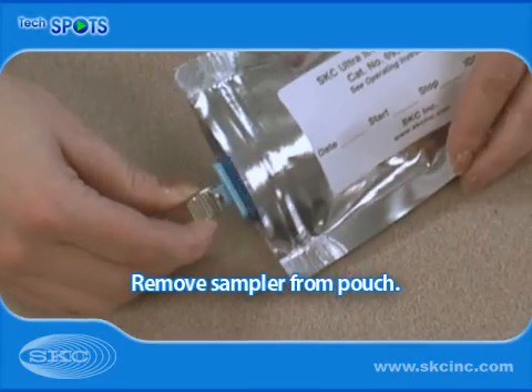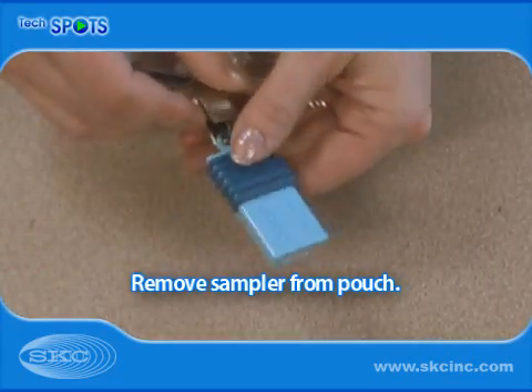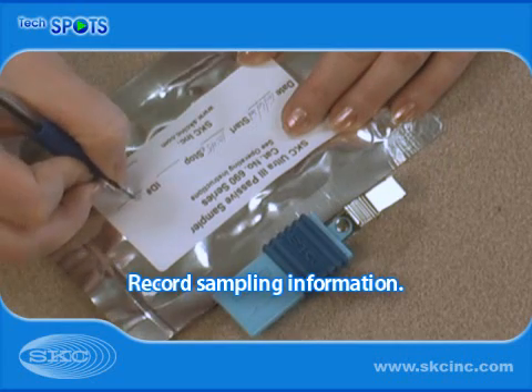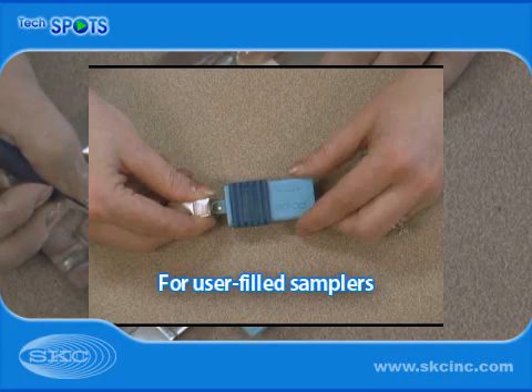Open the aluminized pouch and remove the Ultra-3 Sampler or empty housing. Record the ID on the sampler label, and record the ID, sample location, and date on the pouch label.